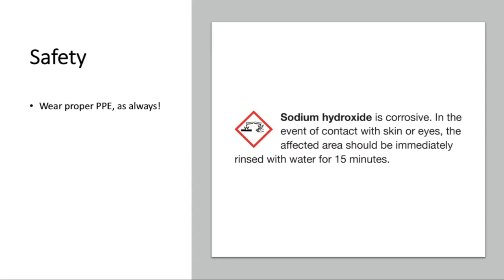In lab today, as always, you should wear the appropriate PPE. This is especially true of the first part of this experiment where you'll be working with the sodium hydroxide. It is corrosive, and so in the event of contact with skin or eyes, you should wash the affected area with water for 15 minutes. Again, make sure you're wearing your goggles and gloves and apron so that you can avoid that in this experiment.